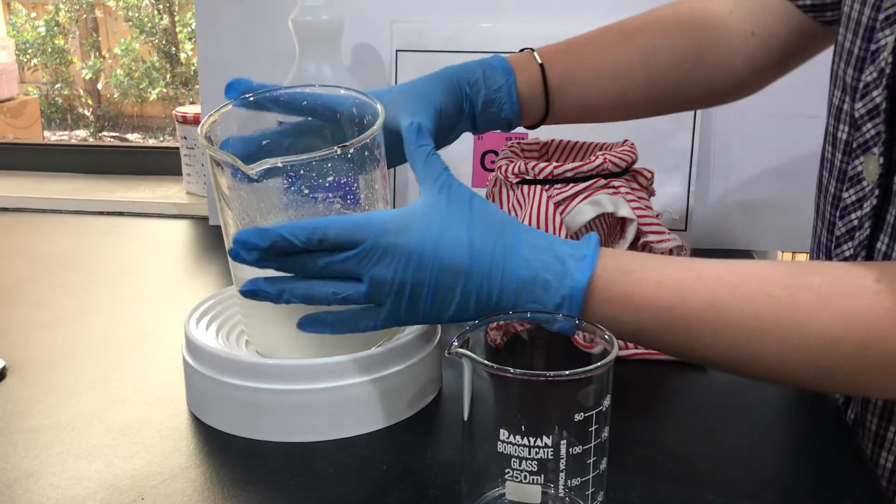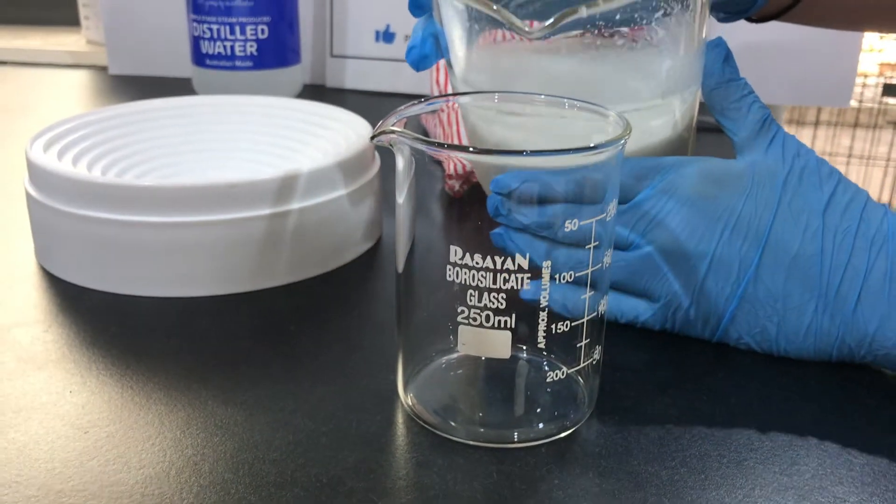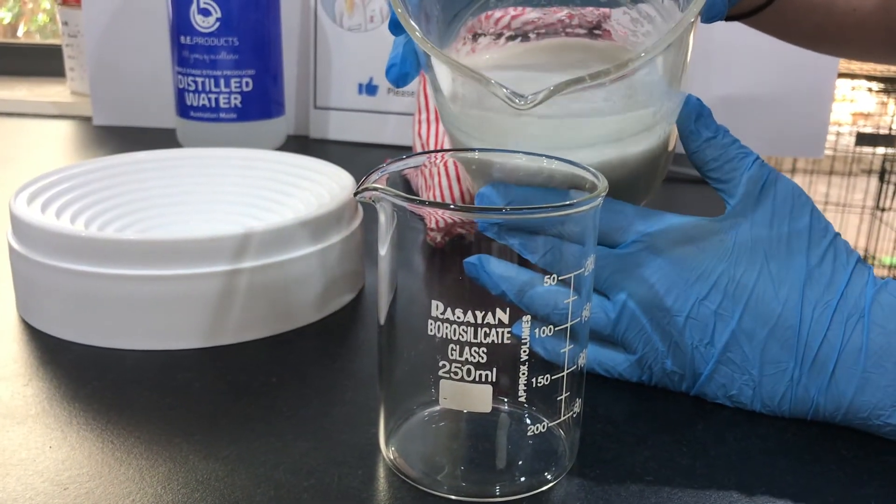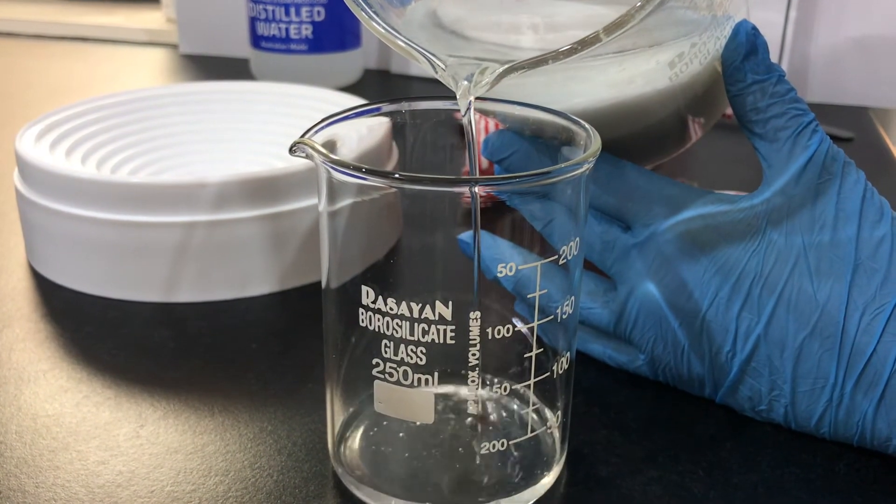We are now going to separate the calcium hydroxide which is the white precipitate at the bottom of the beaker. The best way I found to do this is to leave it overnight to allow the two products to separate. Ensure it is kept in a safe place.